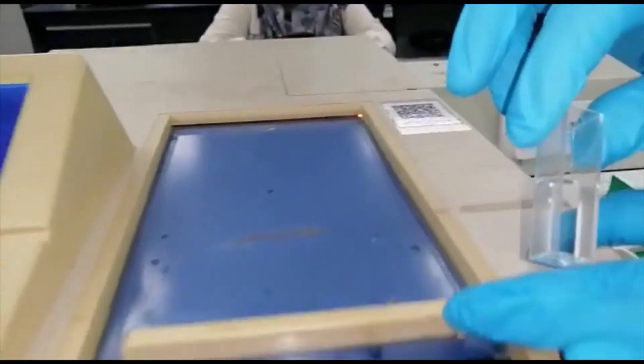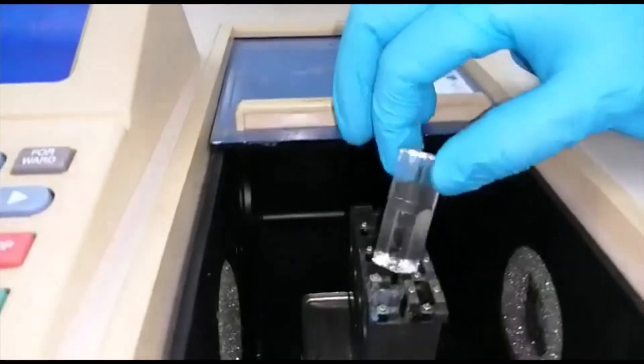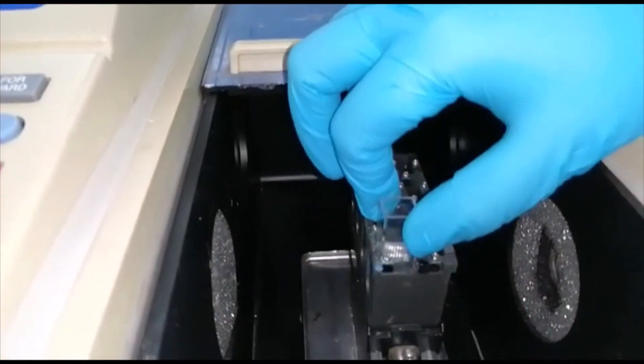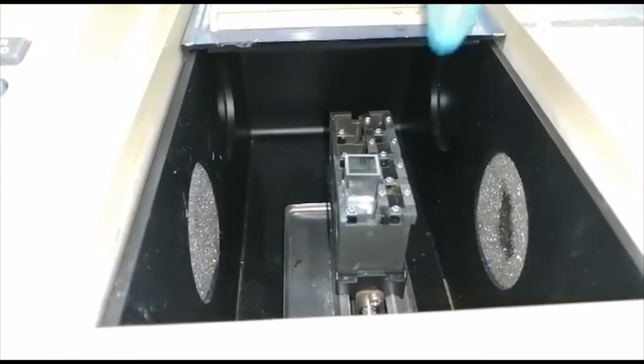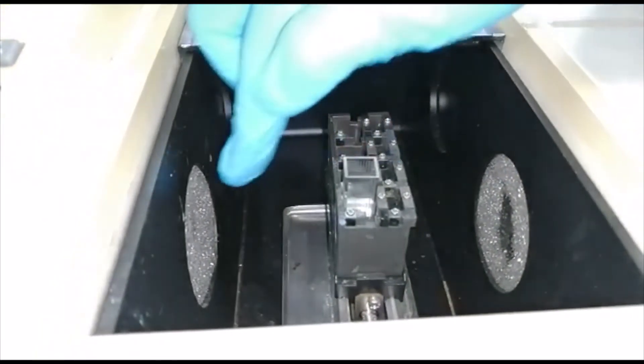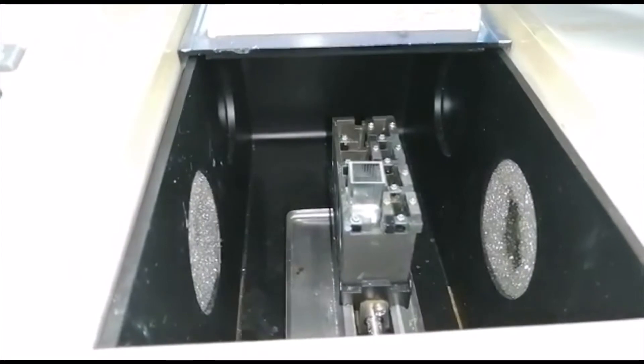Masukkan kuvet ke dalam chamber. Pastikan permukaan optik berada di sisi. Cahaya spektrum akan melalui bahagian sisi kuvet dan terus ke parameter. Tutup.